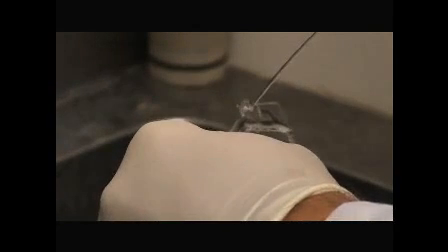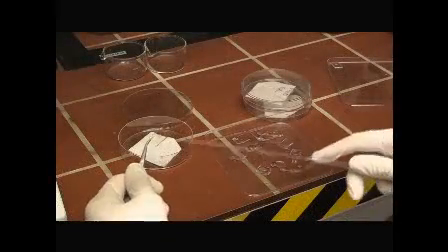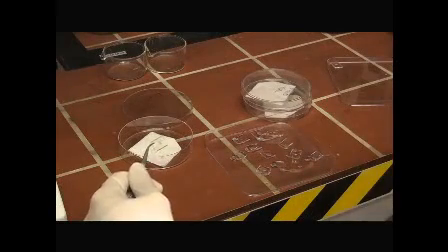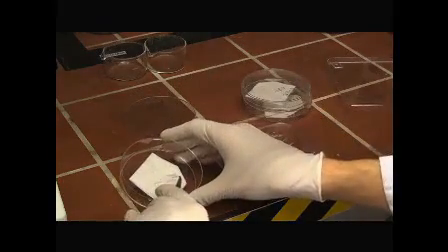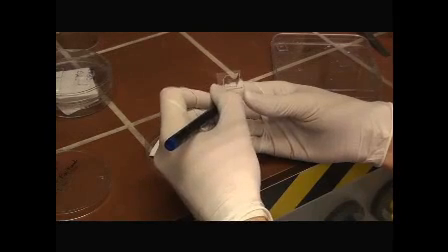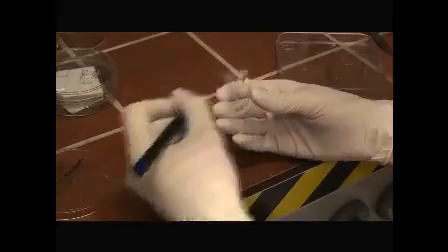For BSA Cy5 transfer, a stamp is dried by nitrogen and immediately afterwards placed under its own weight onto a glass cover slip for 30 minutes. The location of the micropattern field is marked on the back side of the cover slip. Upon removing the stamps, cover slips are sealed with adhesive silicone masks.